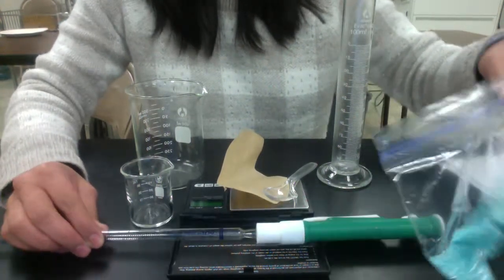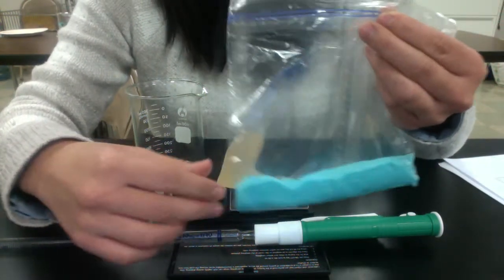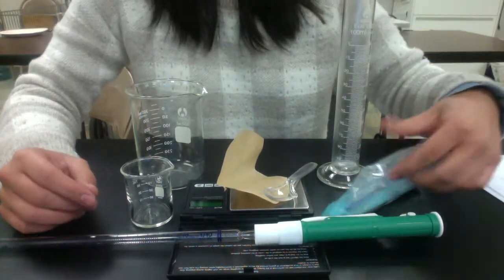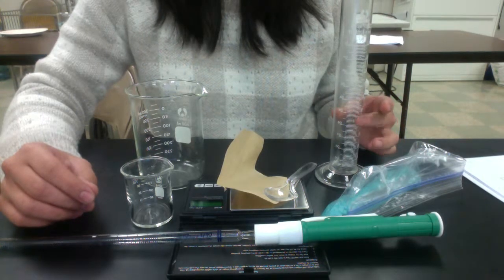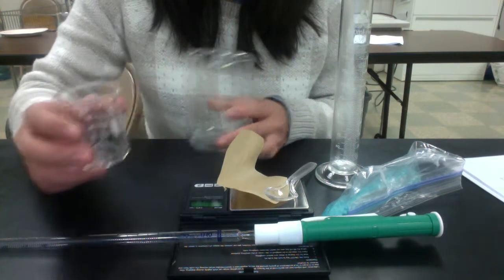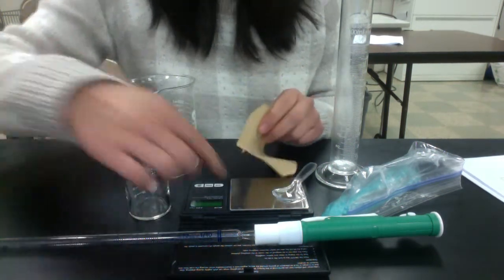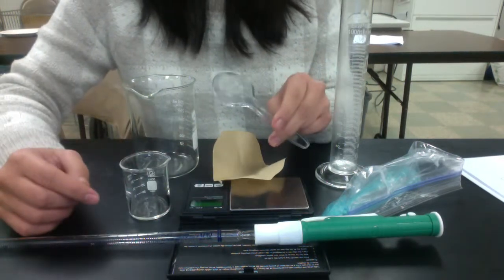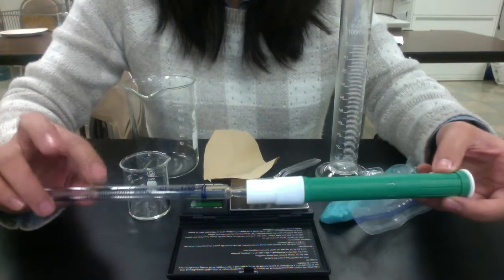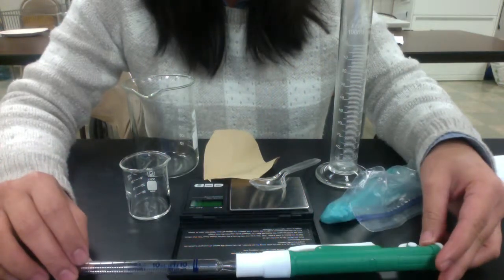First, you need your NaCl, which is in blue. You should have another Ziploc bag with red powder, and the red powder is the C6H12O6. You also have your graduated cylinder, a 400 milliliter beaker, a 40 milliliter beaker, which is significantly smaller, weigh paper, scale, spoon, and your pipette with the glass rod inserted. I'll show you how to do this in a little bit, but let's talk about the details first.